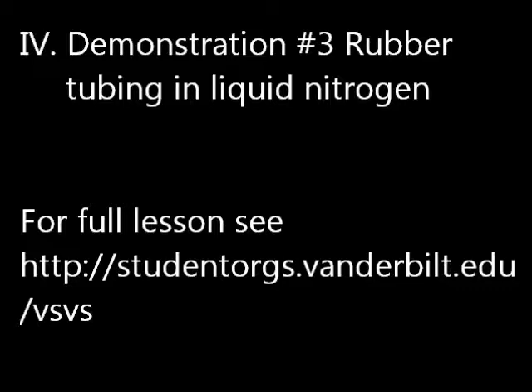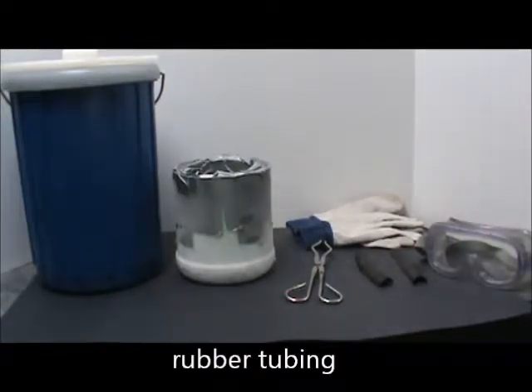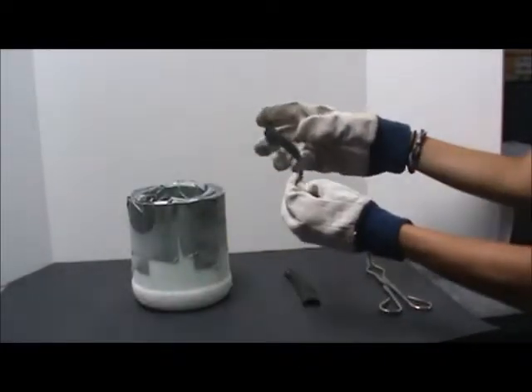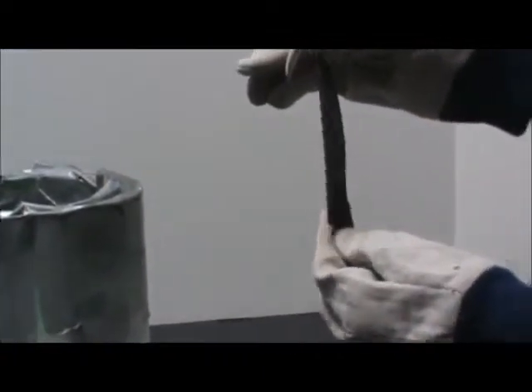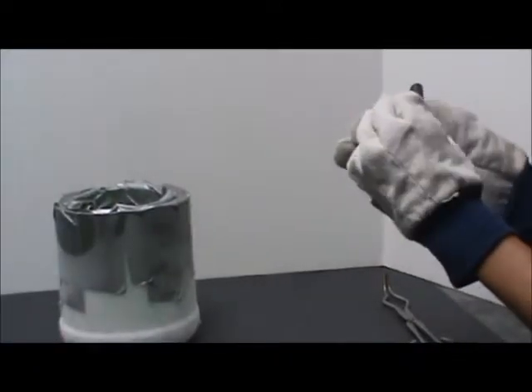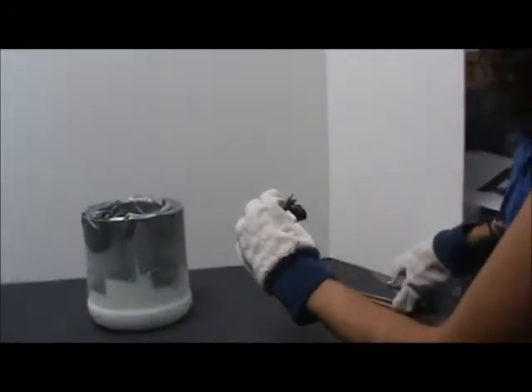Demonstration 3: Rubber tubing and liquid nitrogen. For this demonstration you will need liquid nitrogen, a small dewar, tongs, rubber tubing, gloves, and goggles. Hold up a piece of split rubber tubing and demonstrate how flexible it is by bending it back and forth. Take 2 pieces of split rubber tubing and bend in half at the middle. While holding the pieces of tubing together at the open ends, immerse the bent portions into the liquid nitrogen for about 1 minute.